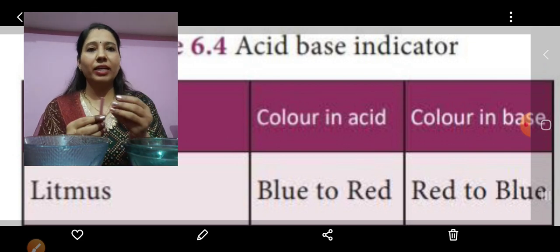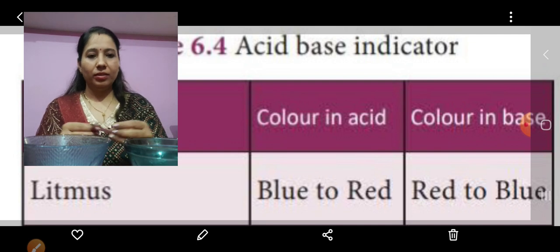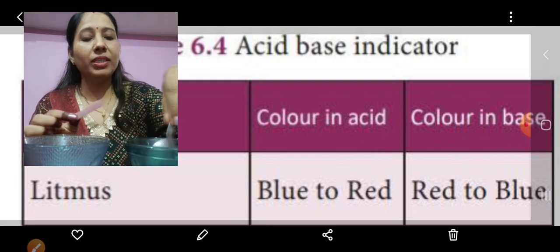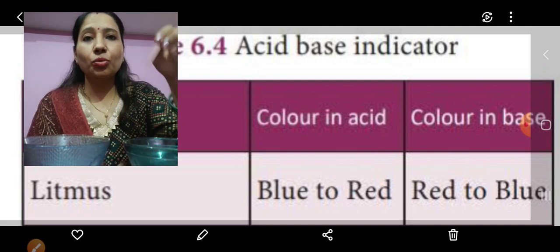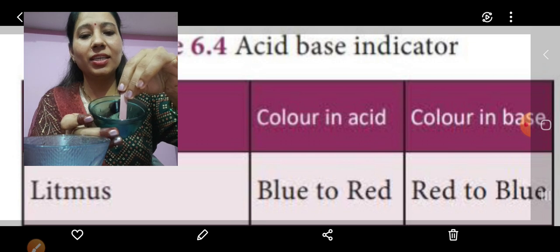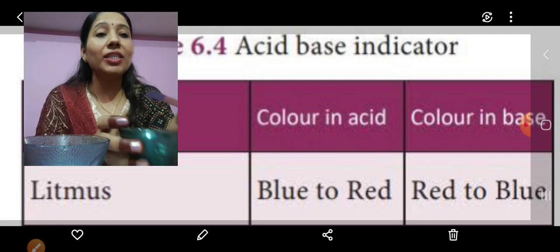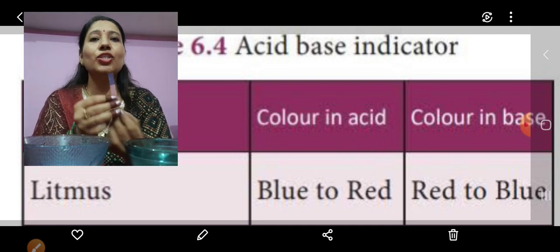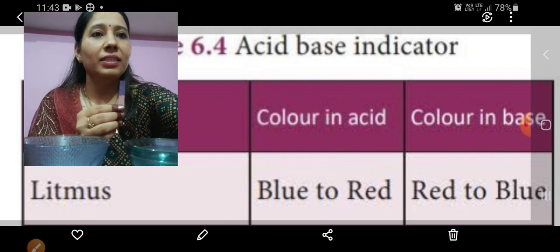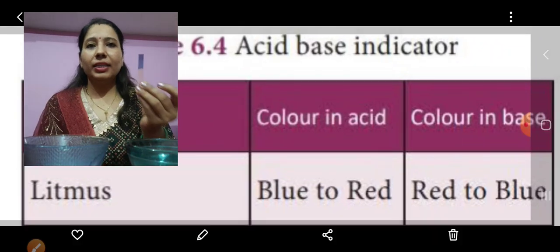Now I will take the red litmus paper — I have taken a strip and will put it in the baking soda solution. Can you see the color change? The red litmus paper turned into blue. You can see on the screen: if red litmus changes to blue, that means it is a base. It is a base.